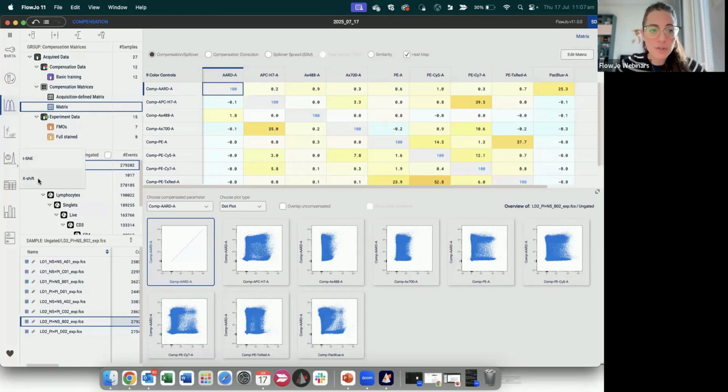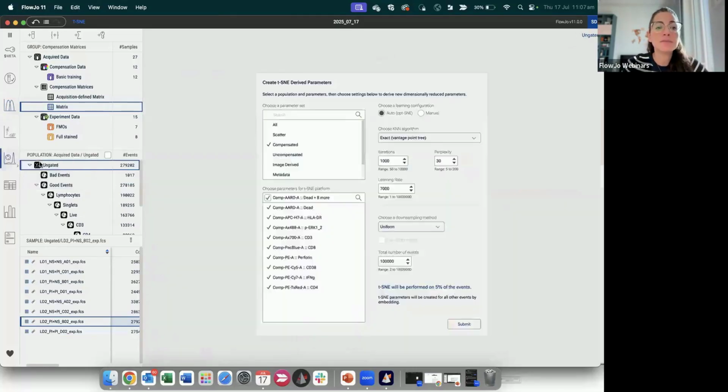This was an introduction to FlowJo, so it's a basic webinar. I think we're planning on giving some advanced webinars as well, where probably we should cover compensation, dimensionality reduction and clustering. It is an opt-SNE algorithm, so not the traditional t-SNE, but the optimized one. Okay, and here you see just the action for that with the downsampling included during the process. Same thing for clustering with X-Shift. So I hope I answered this question, Letizia.